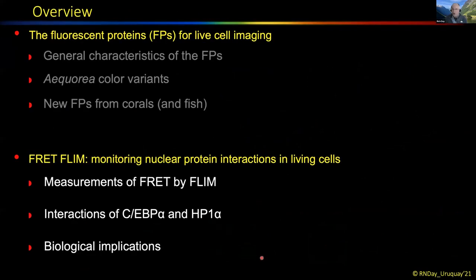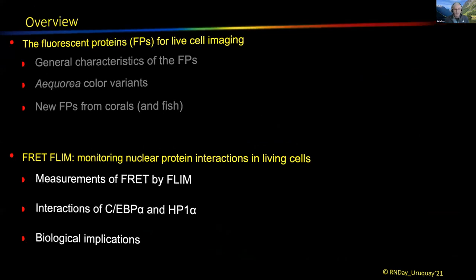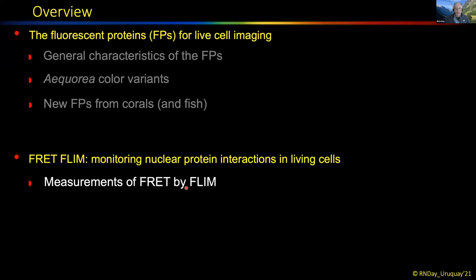So now I'd like to move on and show you how we've been using some of these FPs in our studies of FRET-FLIM to look at nuclear protein interactions inside the living cell nucleus. I'll briefly talk a bit about FRET and FLIM. You've already heard everything from Dave and Enrico, but I just want to touch again on the use of FLIM to measure FRET.